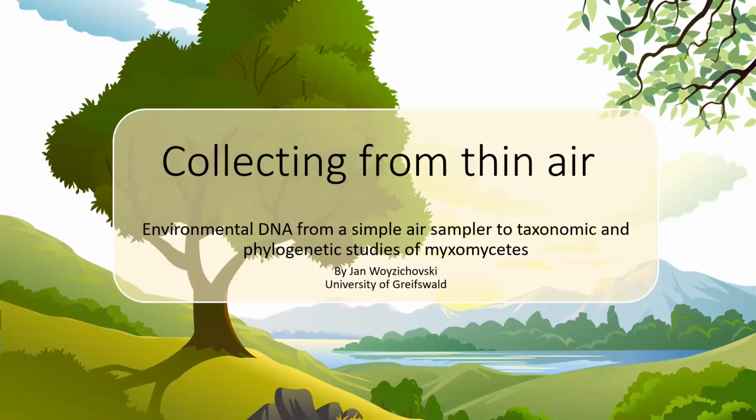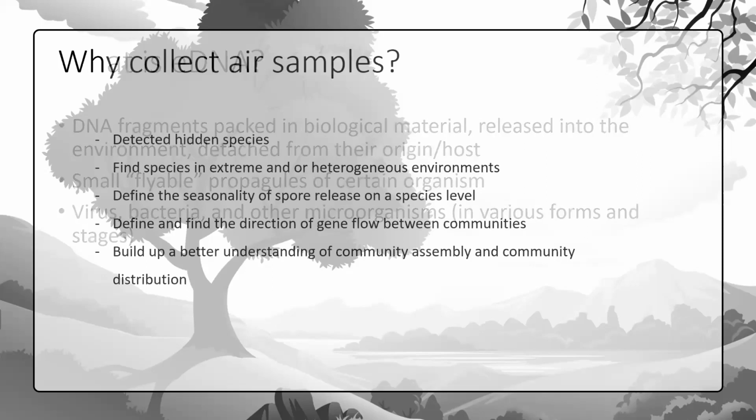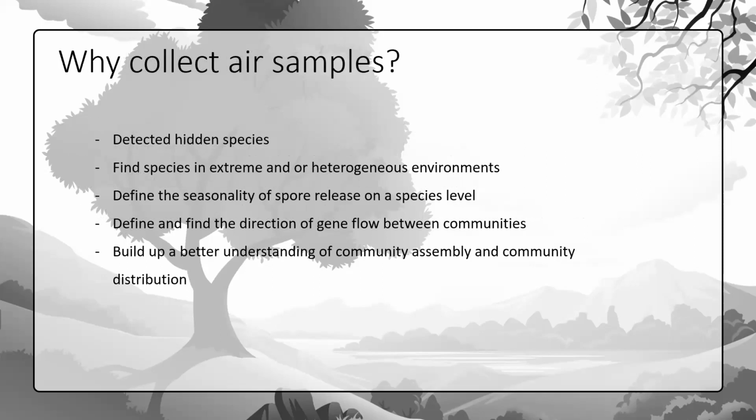air. So, usually if I give this kind of talk, I have to explain the definition of eDNA, but I guess in this round it's not really necessary anymore. So I can go over and save some time. Then, of course, this animation is still remaining there. But anyway, going to the question of how we can at the end collect, switching now instead of collecting soil or water samples, going to collecting air samples, is the question why we should do this.